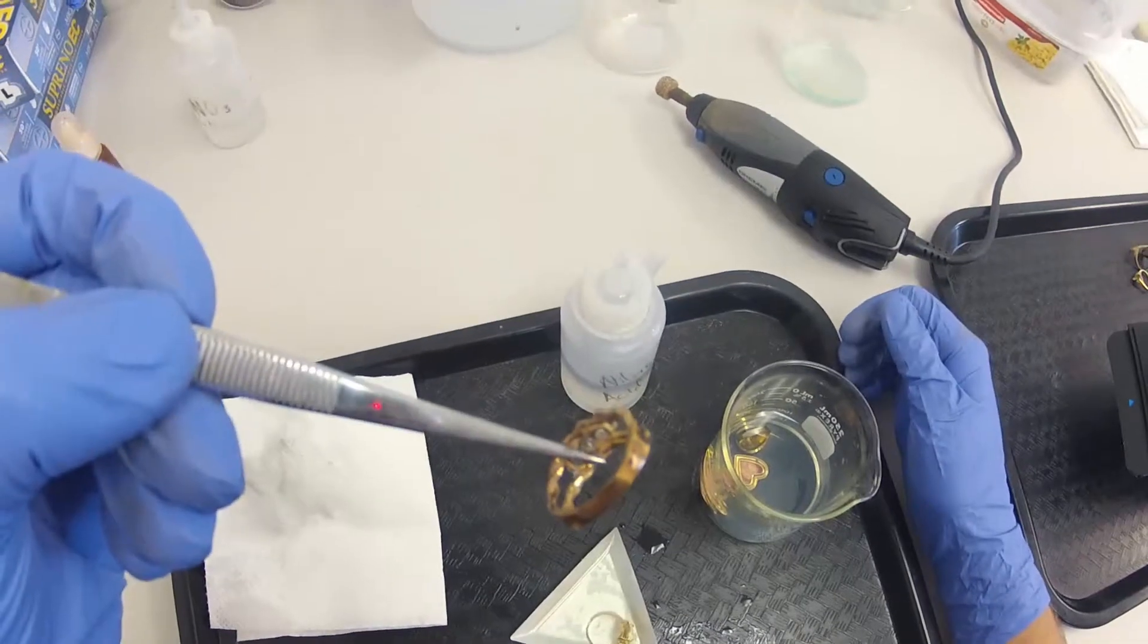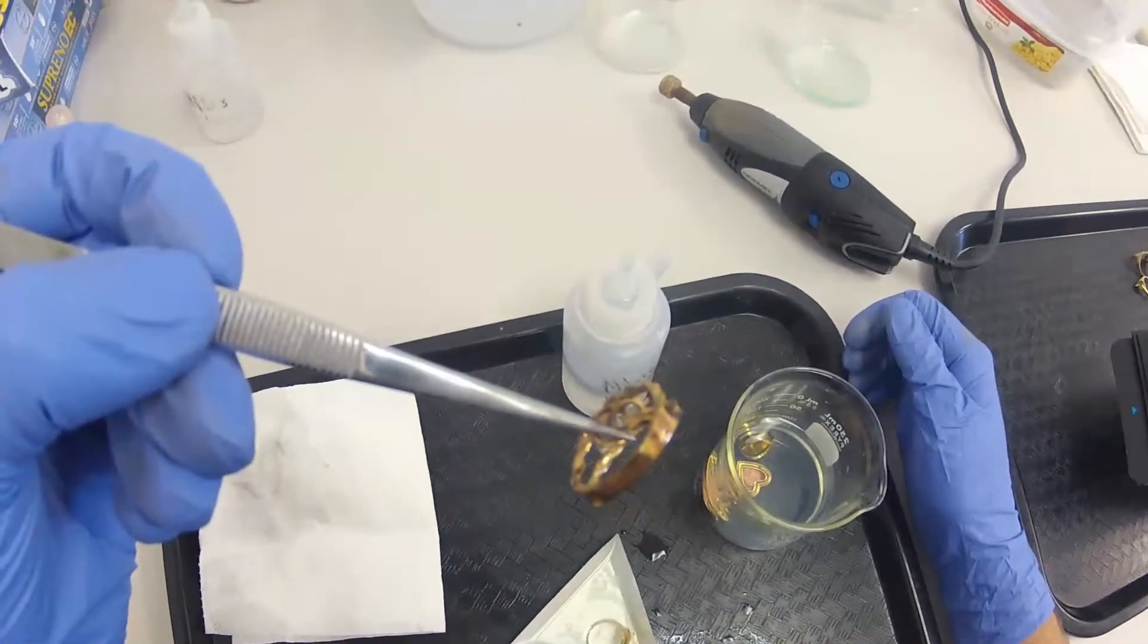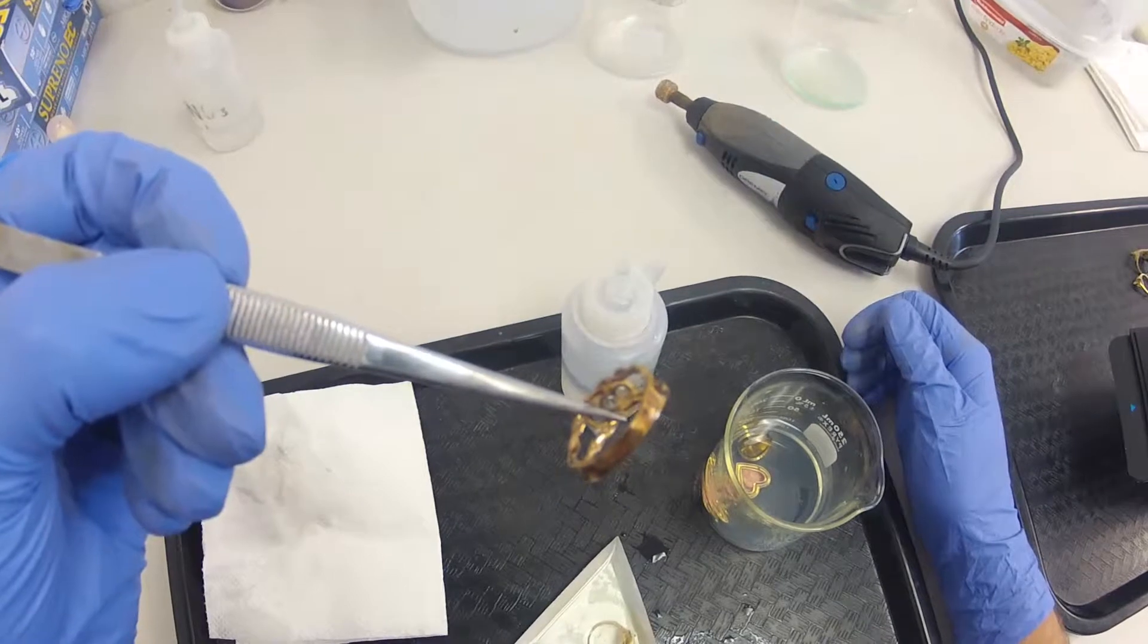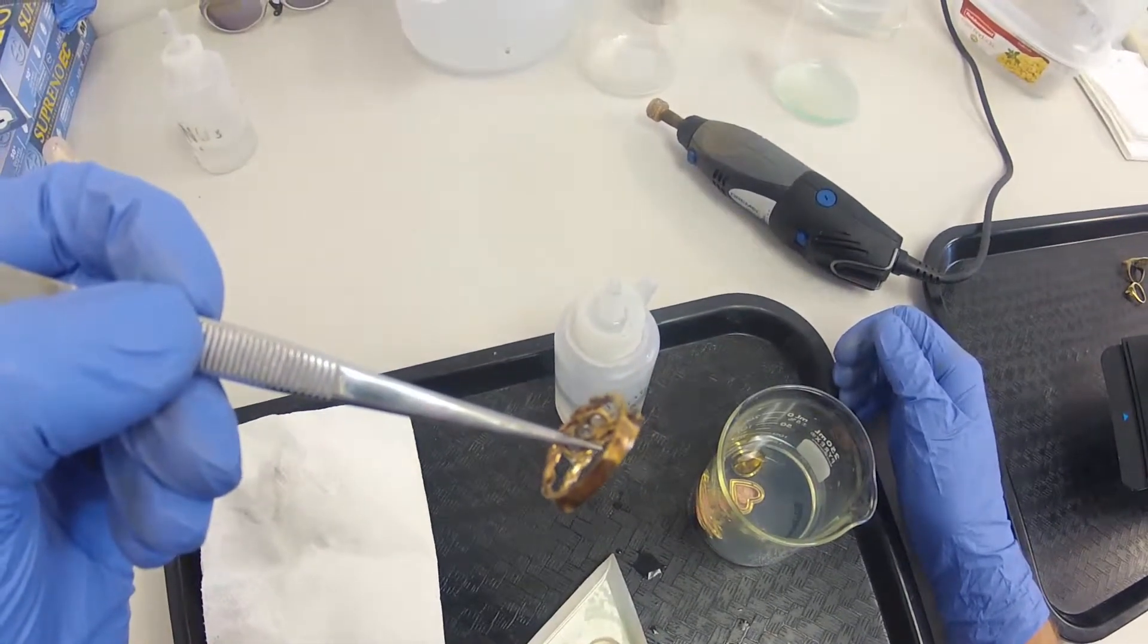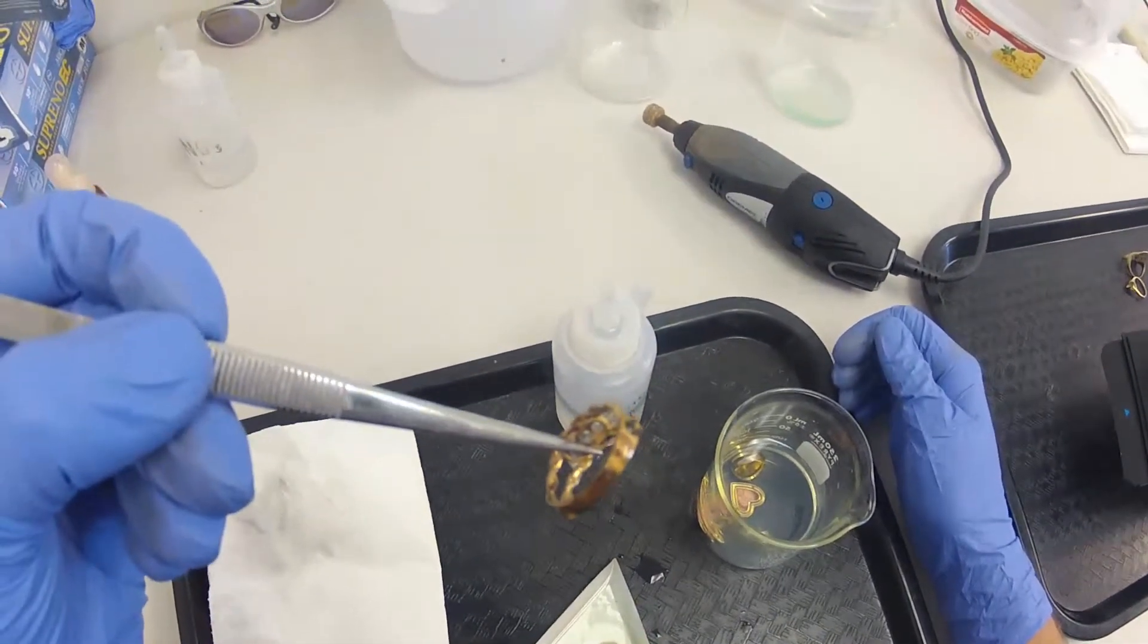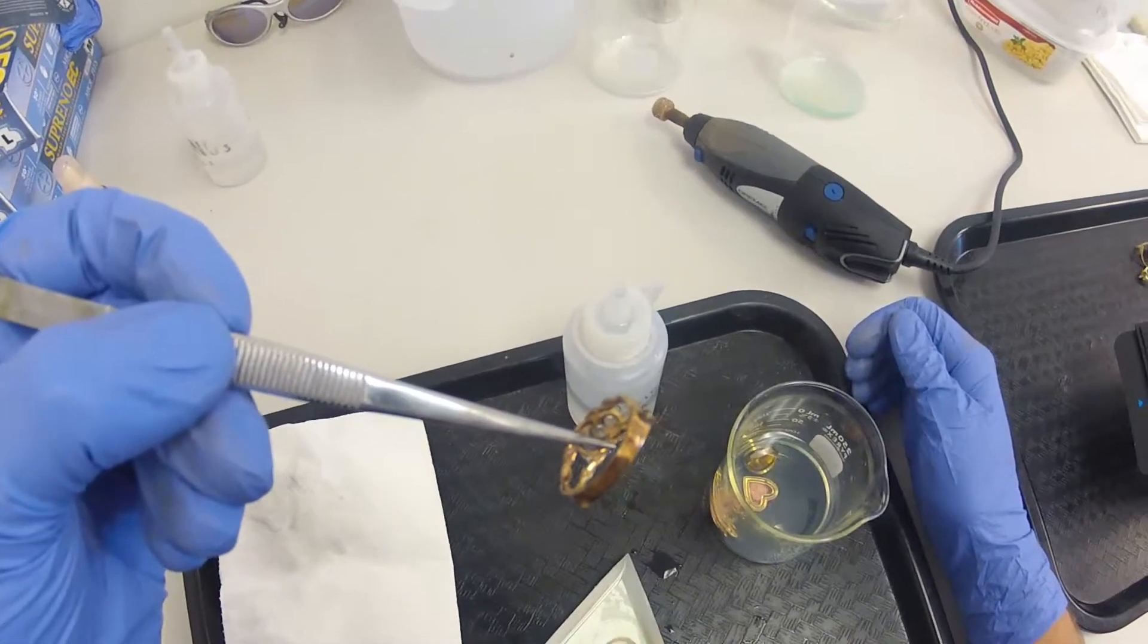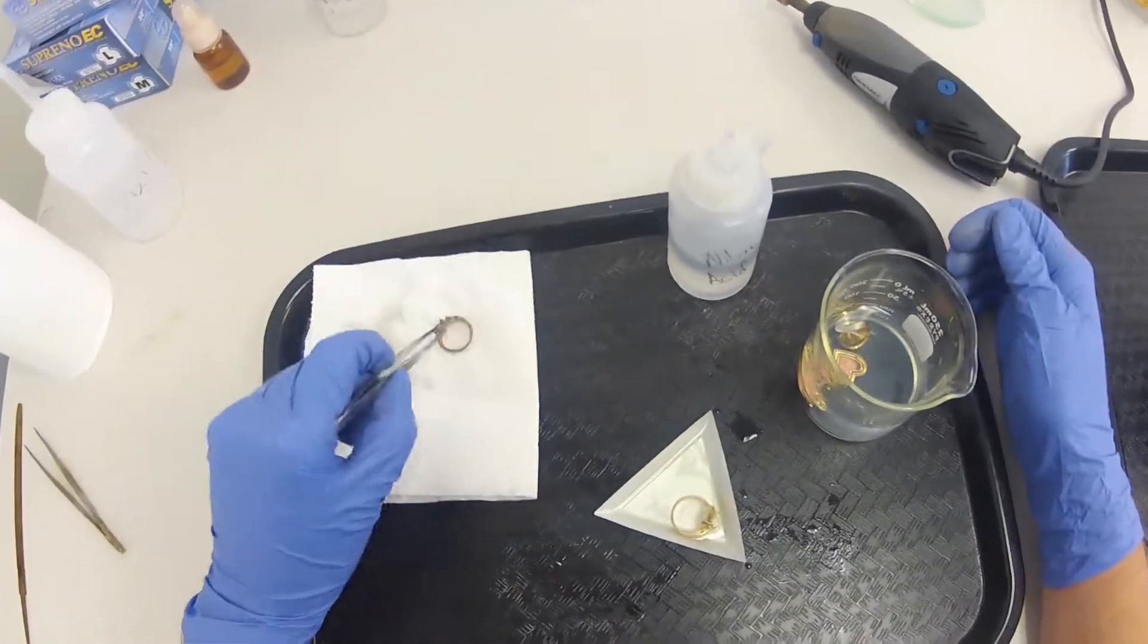You can see how it's a real dark color. And that's because the acid has started eating away at the base metal that's alloyed with the gold, resulting in that dark brownish color there. So that's how we know that's 10 karat.